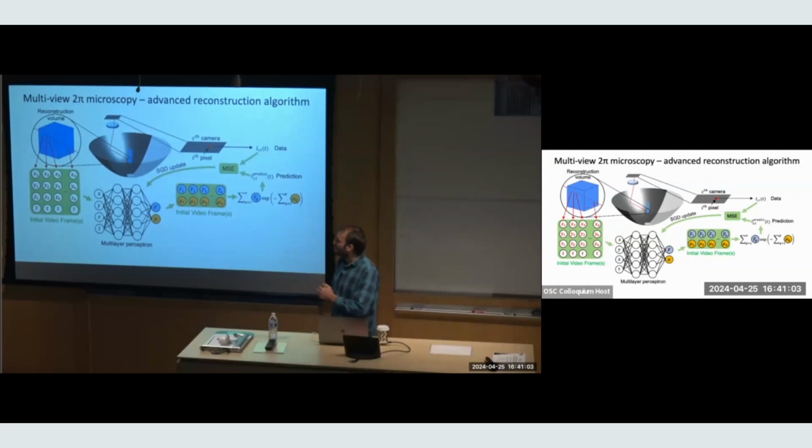For this approach, we've essentially adopted a NeRF-type reconstruction method, a neural radiance field type method, where we have points in the scene, X, Y, Z, and time. Those pass through a neural network to give us an associated absorption and fluorescence emission value for that voxel at that position in time. We then create our arrays and do the exact same thing to form a simulated image pixel. Our mean squared error loss, comparing our data to our prediction, is simply a function of the weights of the neural network now, instead of the actual absorption and fluorescence emission values.